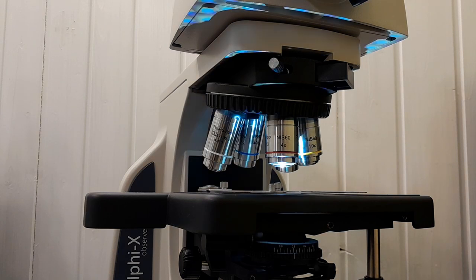So the light in other words is split into two parts and this allows you to take pictures and to observe them at the same time. Now even when you are redirecting part of the light to the camera then the lamp is still so extremely bright that you will have enough light present even for the higher magnifications. And that is actually also one of the things that I would like to mention is that this is possible because the lamp itself is not located directly in the base of the microscope but rather on the back side and then it is redirected forward and then using an optical system the light is redirected upwards here. And this basically means that by having the lamp in the back of the microscope this allows you to have a more powerful light and also a better cooling system. As a matter of fact the most larger and more advanced microscopes do not have an LED or halogen built in in the base but rather separately in the back.